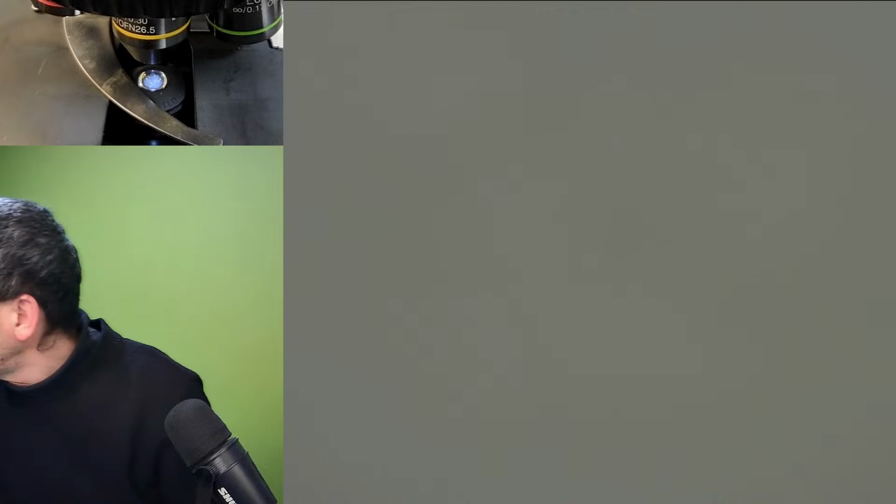So what I want to do now is show you some regular cotton that I've got here. With a polar, you know what? That's a good point. Let's try that. Thank you for the comment. I put it again over here, and I'm going to now hold the polarizer over it.